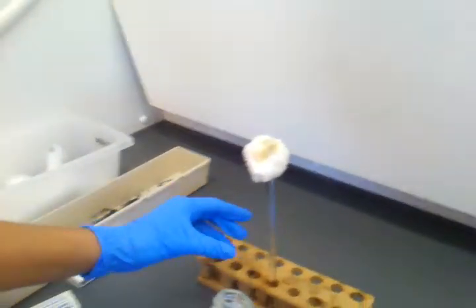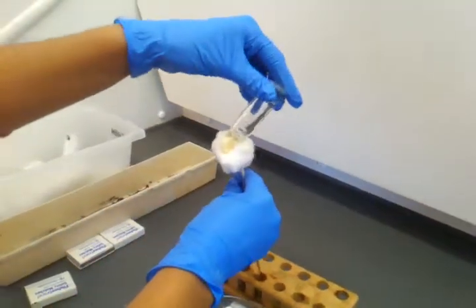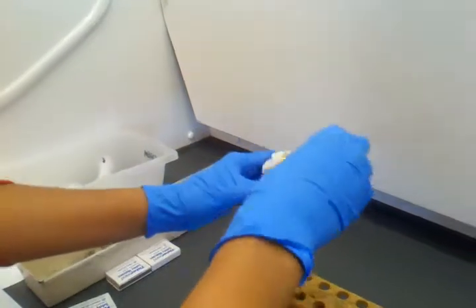So we made biodiesel and we're putting it on cotton. We have to record the results. So I'm literally recording the results. Do you want to put more on it? That's kind of fine though. Do you have more?